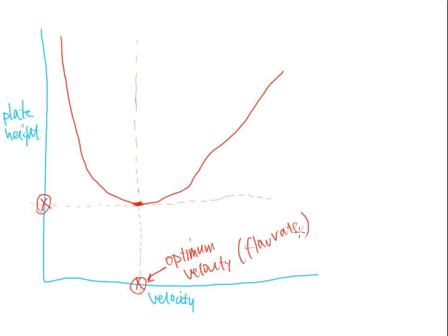That's really what this kind of boils down to, right? So the Van Deemter equation takes all of these factors into play, and it basically provides me some insight on what the optimal flow rate is going to be for my method that I'm using.